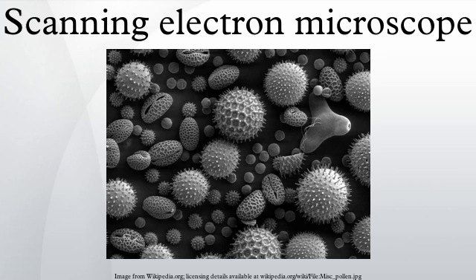The carbon dioxide is finally removed while in a supercritical state, so that no gas-liquid interface is present within the sample during drying. The dry specimen is usually mounted on a specimen stub using an adhesive such as epoxy resin or electrically conductive double-sided adhesive tape, and sputter-coated with gold or gold-palladium alloy before examination in the microscope.